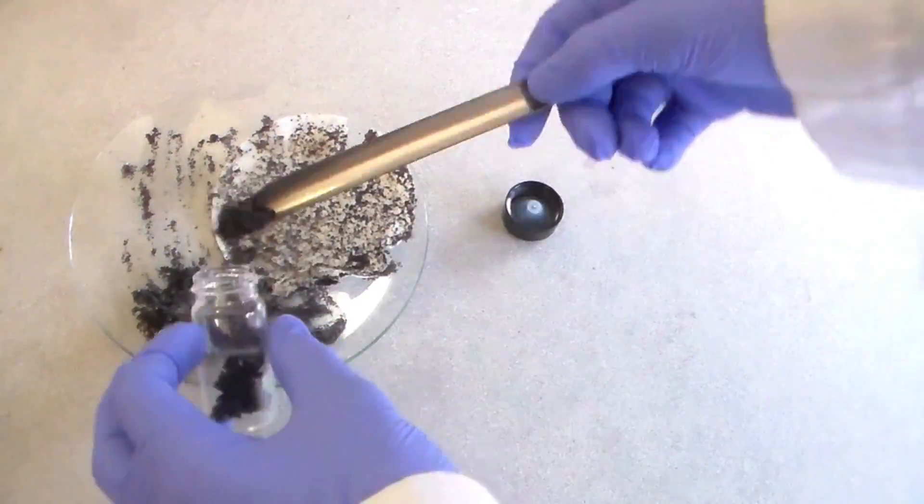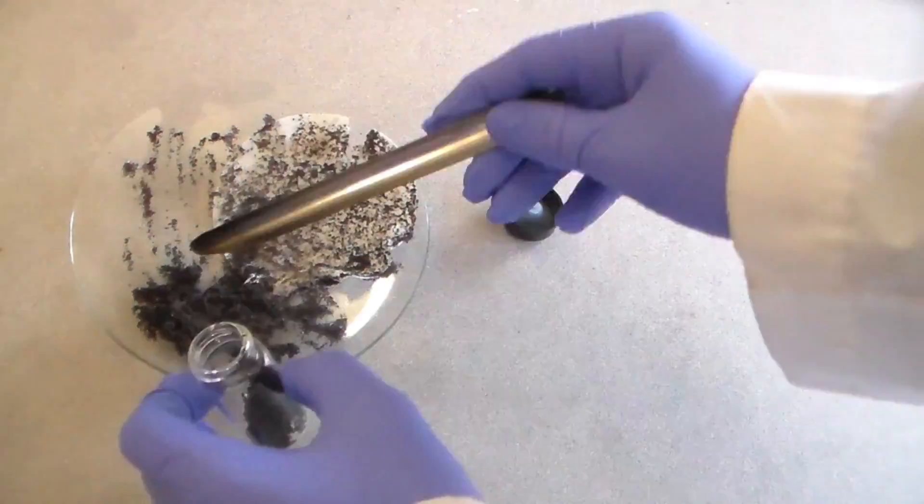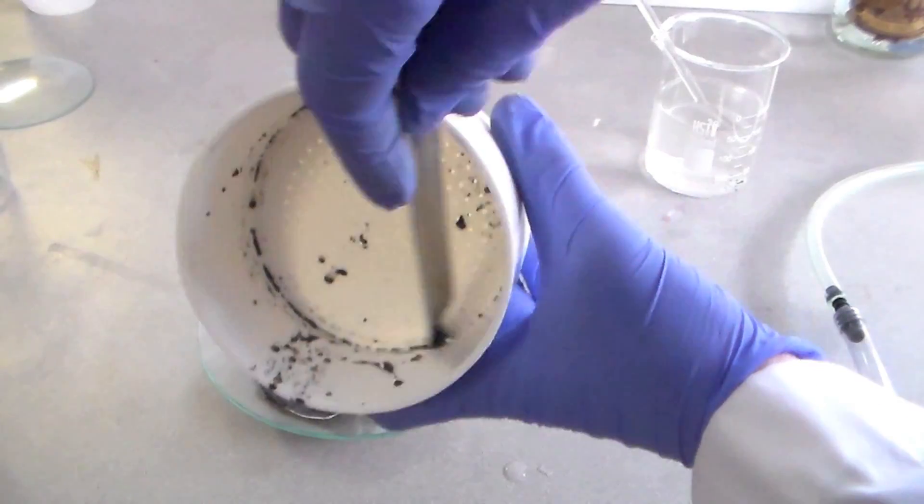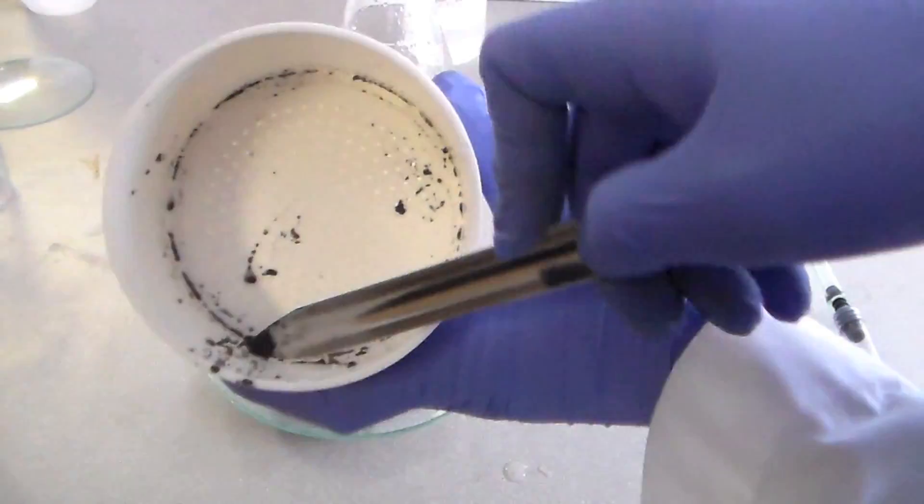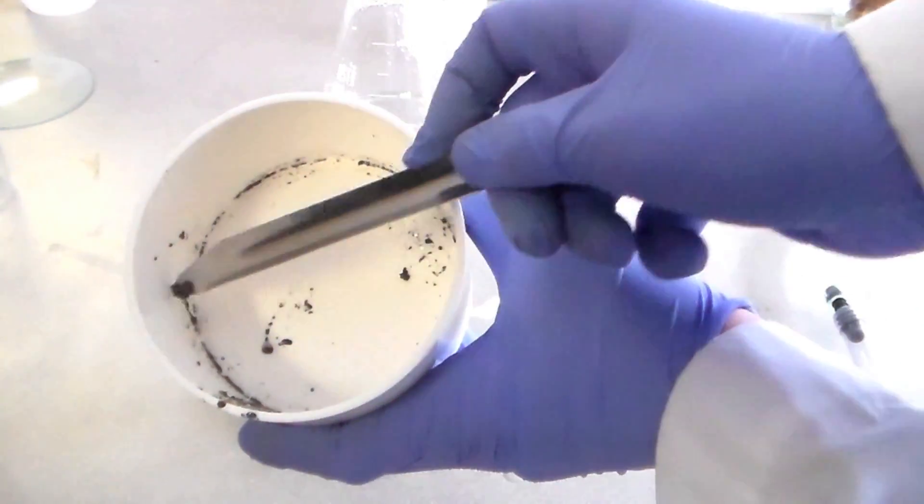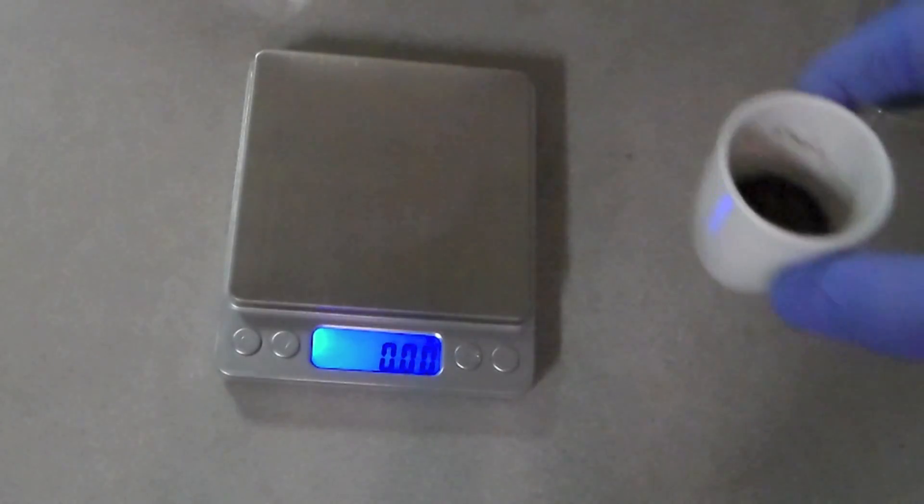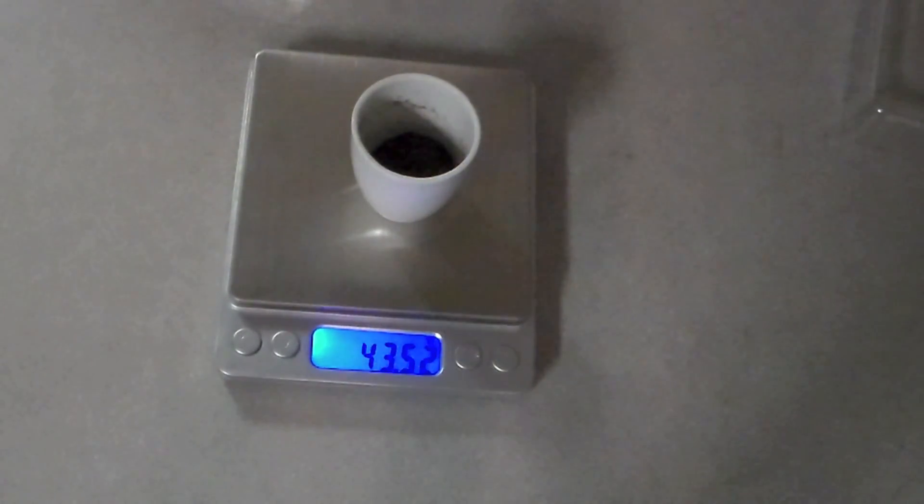and also that I lost some product by it adhering to the filter paper and Buechner funnel, I highly doubt that I achieved anywhere near a 50 percent yield. Obviously, not all of these 3.82 grams are actually silicon.